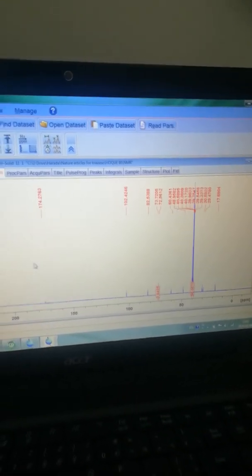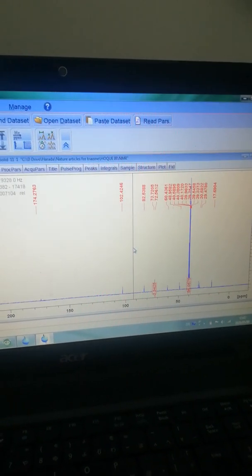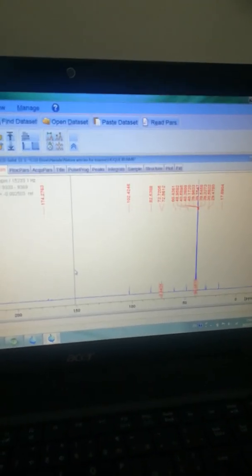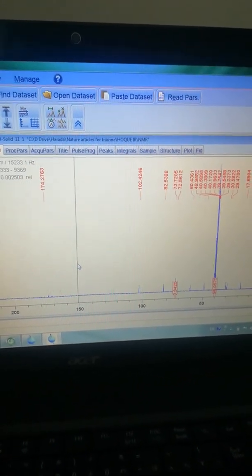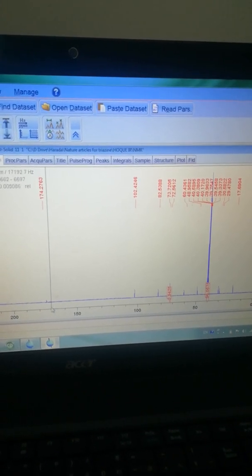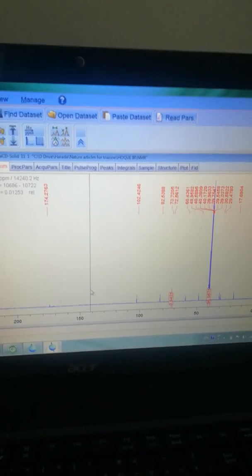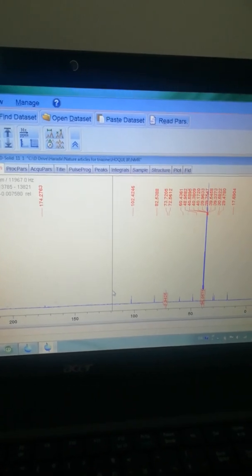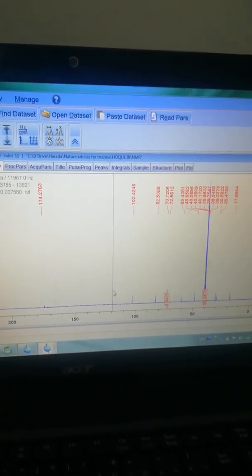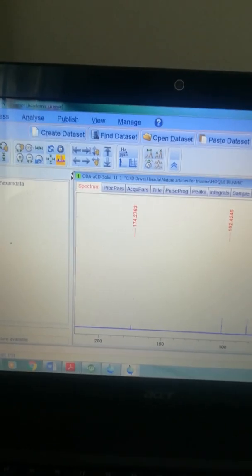Now it has appeared. You can see the total scale is 0 to 200. We don't need that full range, but in my case the NMR spectrum has some aromatic components, so regions around 150 or 170 and 80 are important. The peaks are a little bit small, probably due to sample concentration, but noise is almost eliminated.